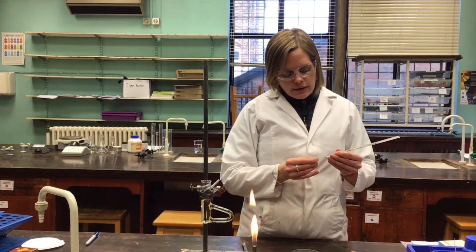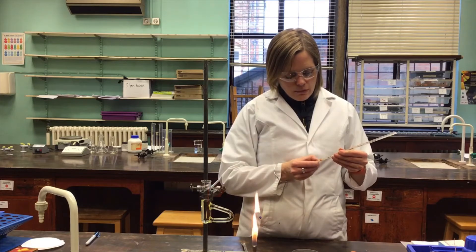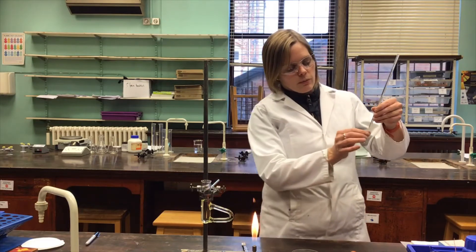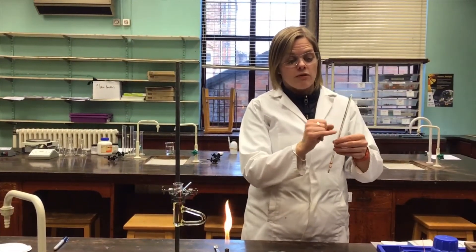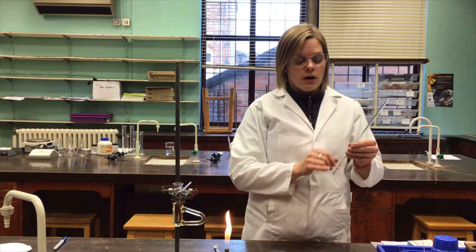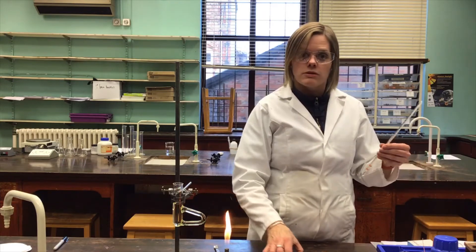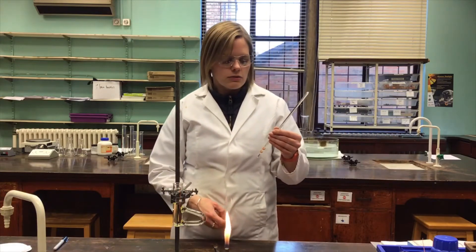Now that I've got both rubber bands on, I can very carefully move the capillary down so that the end with the sample is at the same place as the bulb of the thermometer. I need to be really careful — this is a mercury thermometer. We need it because the temperature range must be high enough for this experiment, but if it breaks, mercury is exposed and there are very strict procedures to follow, so let teachers know straight away if anything goes wrong.